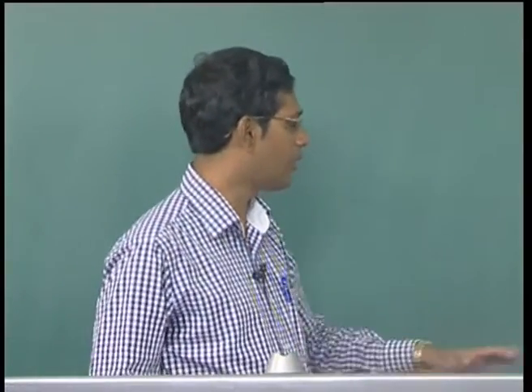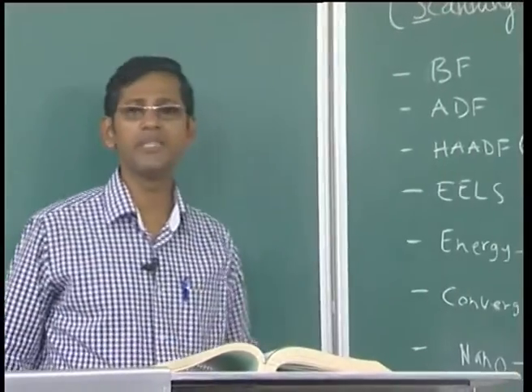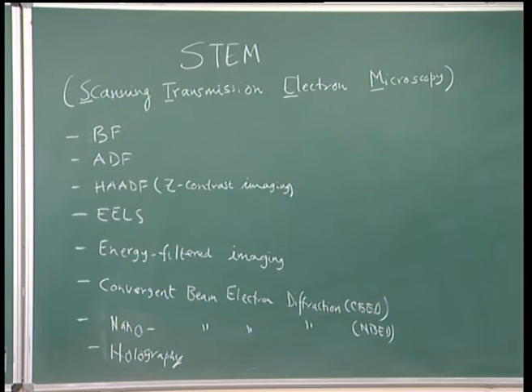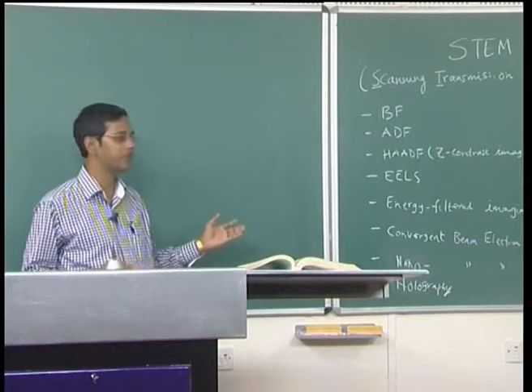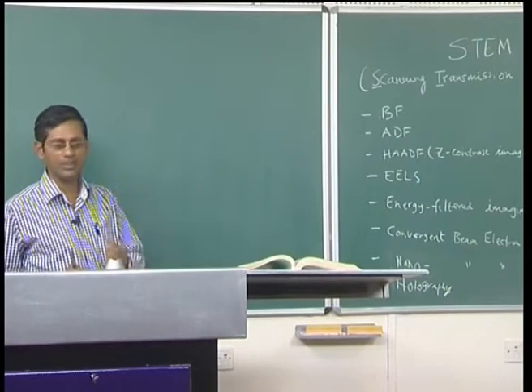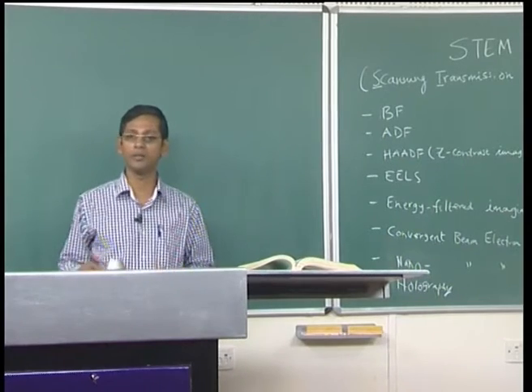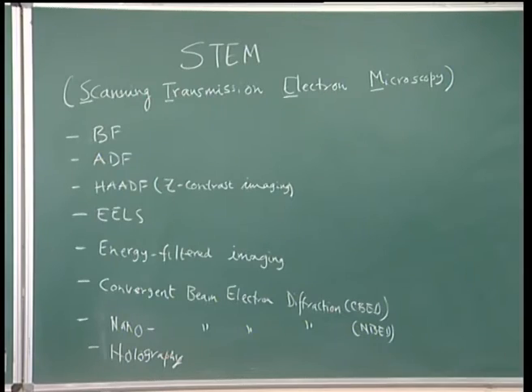As you see, I am not going to discuss holography here; it is itself a big subject. Using all these kinds of detectors in scanning transmission electron microscopy, one can obtain information encompassing normal bright field, annular dark field, Z contrast images, composition analysis by EDS, energy filtered images by EELS, as well as diffraction information by nano beam electron diffraction. So, it seems that it gives all kinds of information, and obviously the advantages are many, but there are disadvantages.